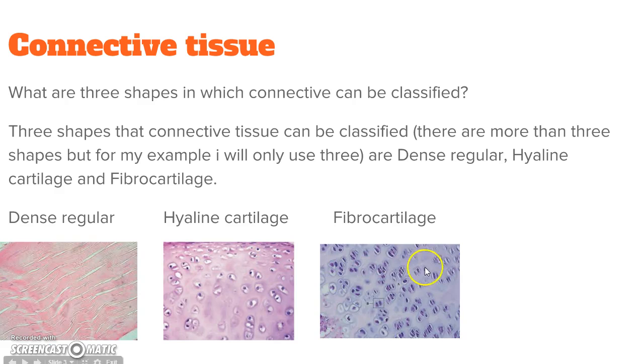It's all in one area. This one's probably one of the best ones to look at. It's all in one area and they're lined up kind of like corn rows. Like in a cornfield, all the corn is in a direct line and it's all very organized and very identifiable.